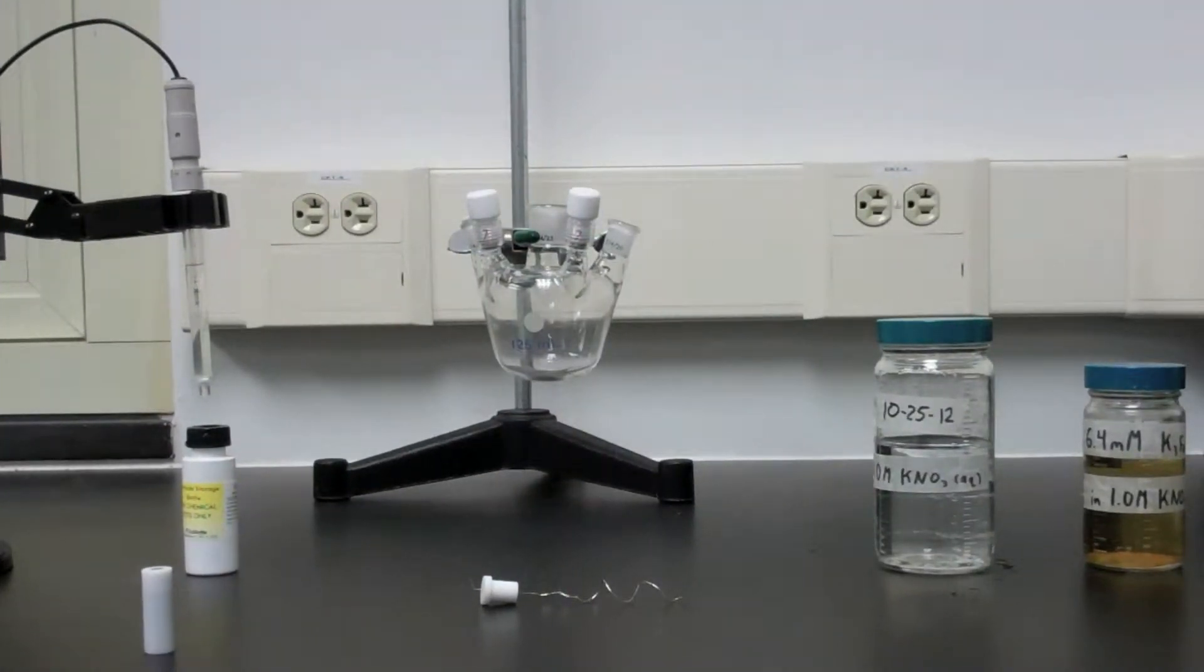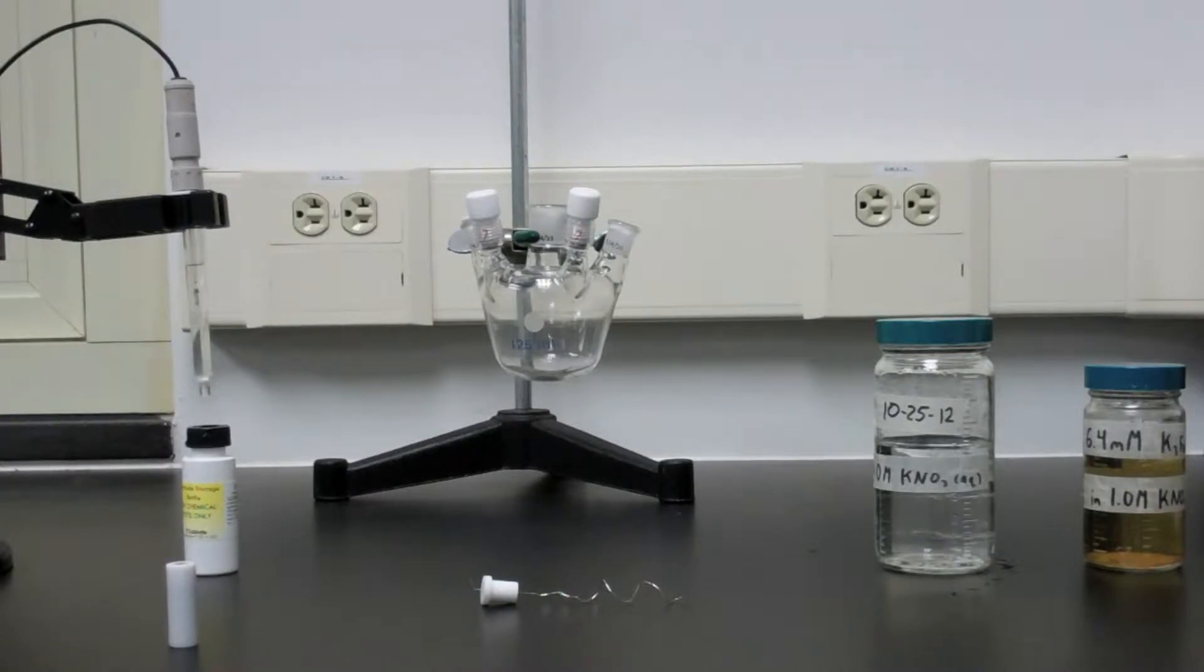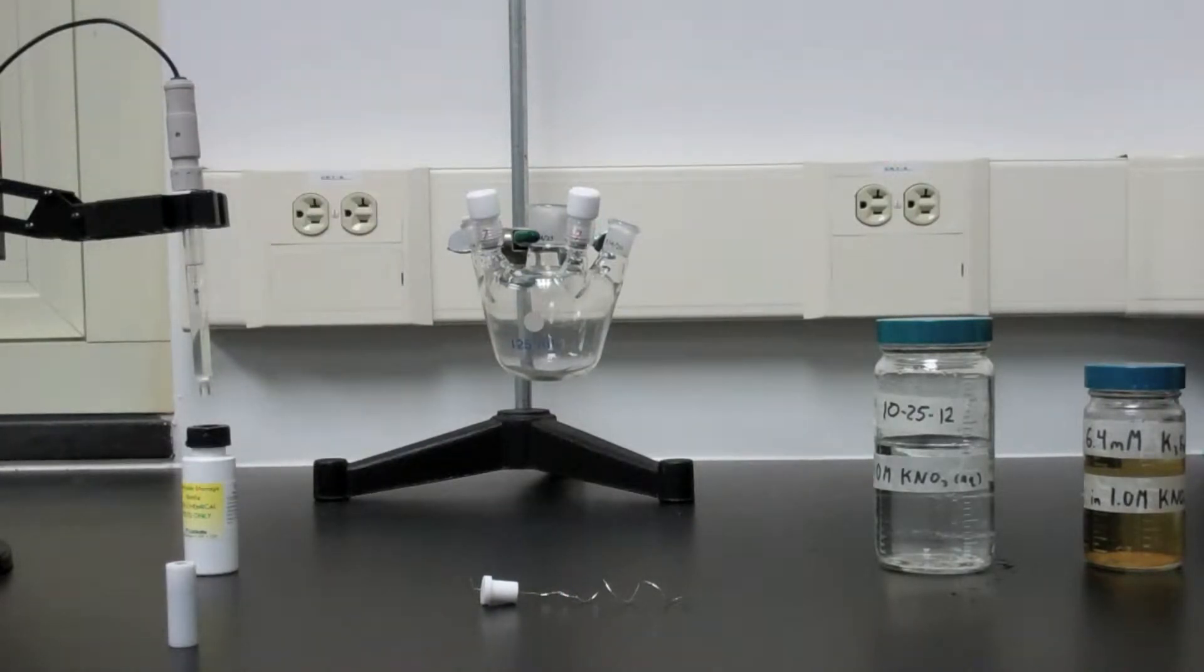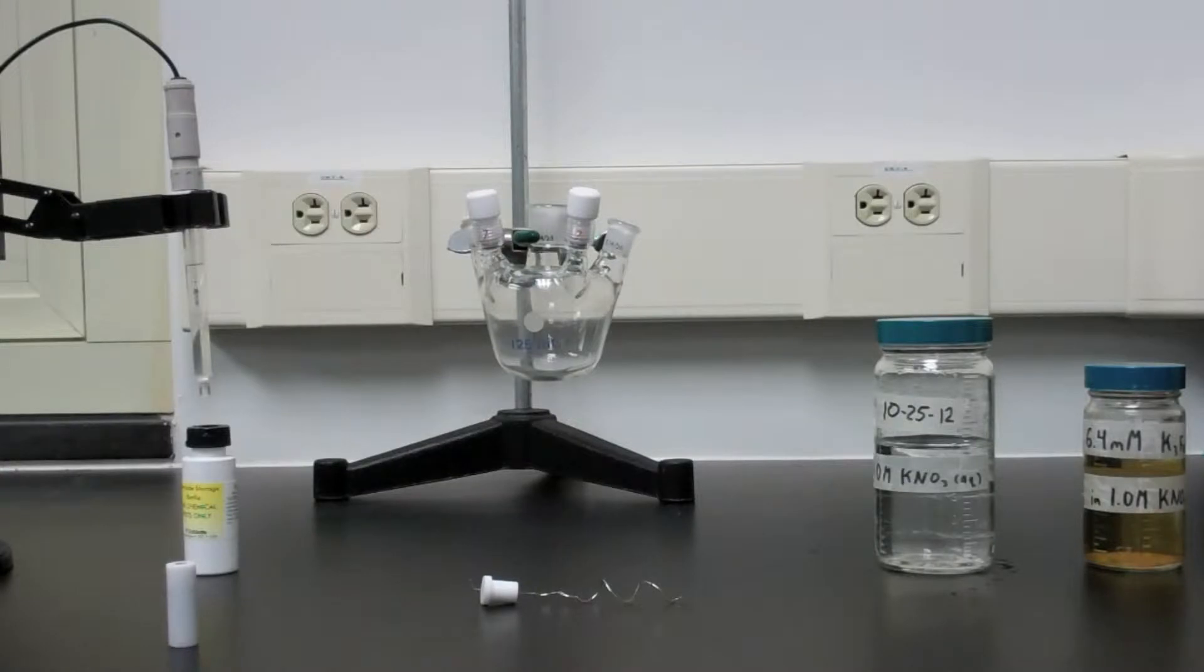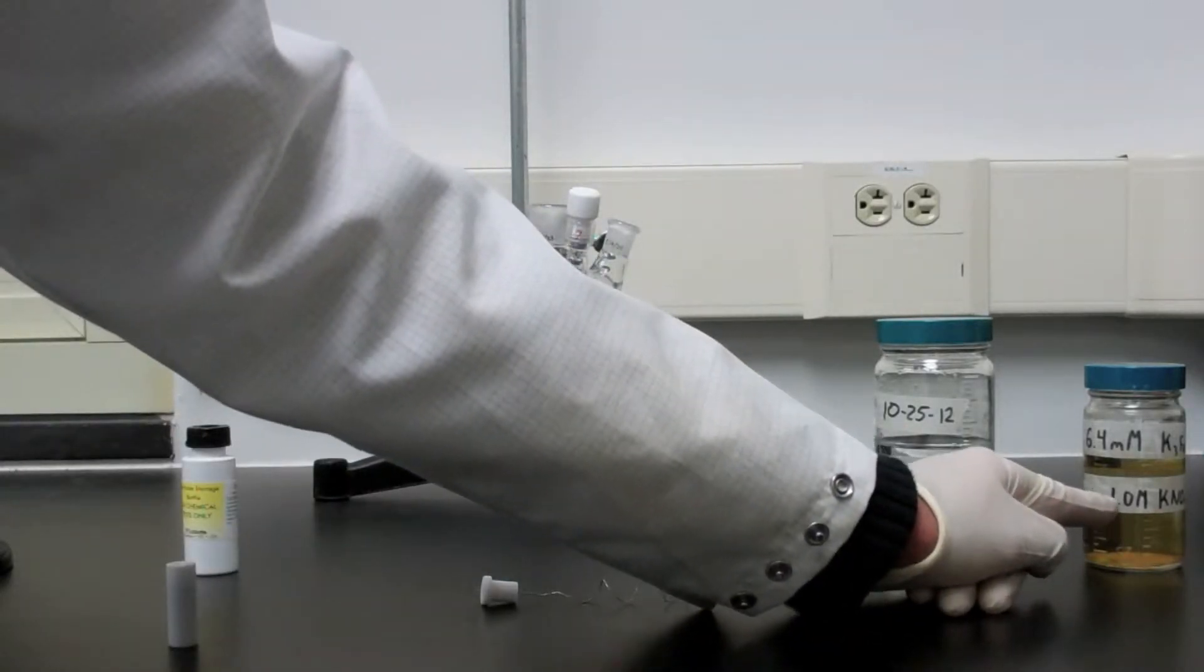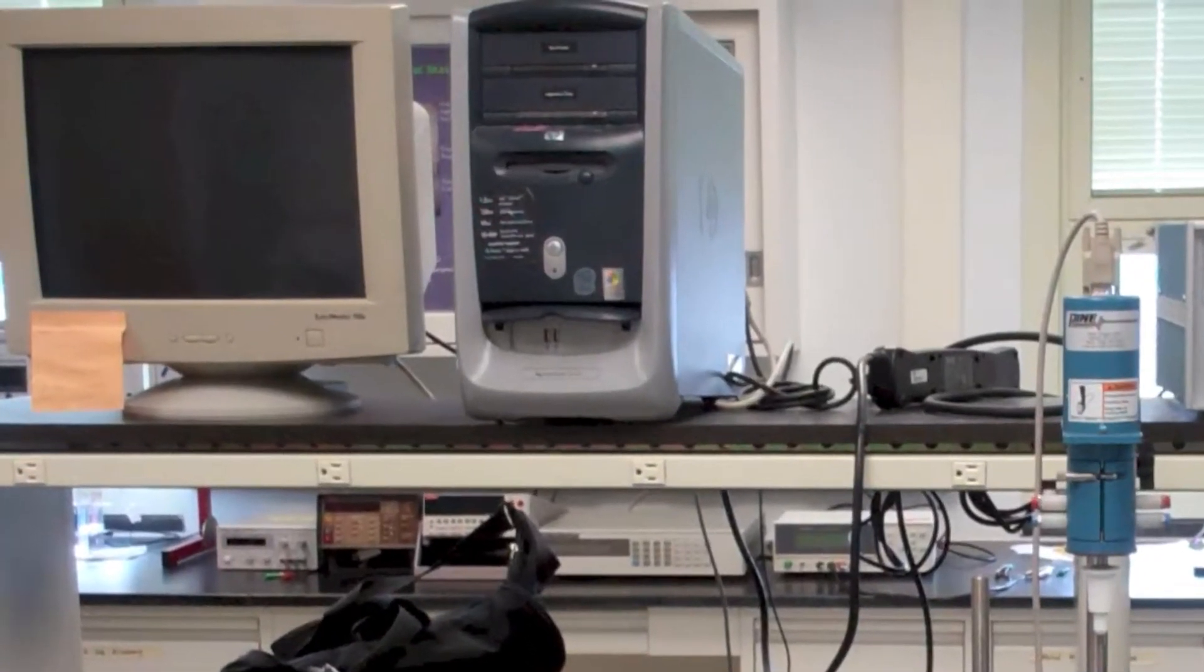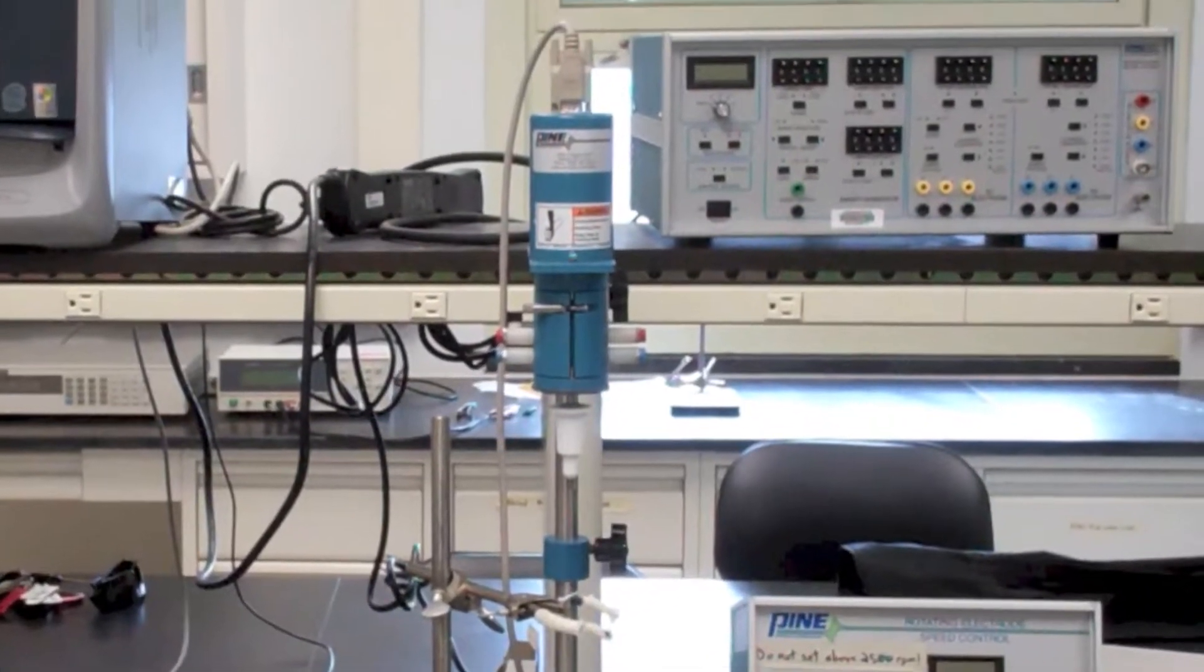For this lab you will need a polished platinum working electrode, a platinum counter electrode, a glass frit calomel electrode, a glass multi-port reaction vessel, one molar aqueous potassium nitrate solution, 6.4 millimolar potassium ferrocyanide in one molar aqueous potassium nitrate. You will also need a computer to communicate to the bipotentiostat, a working electrode module, and a bipotentiostat.